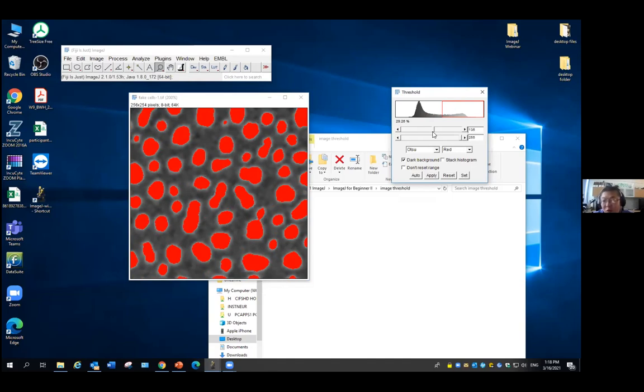But once you make this decision, you have to use the same value on all of your images, so you can compare the results. In all image acquisition and digital image analysis, the emphasis is not on how good a result you can get from a single image.